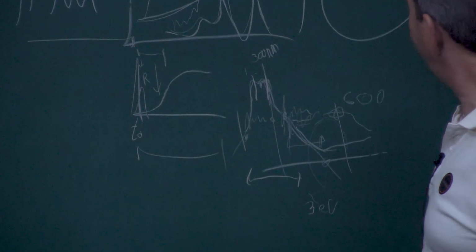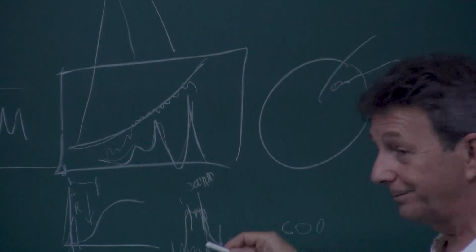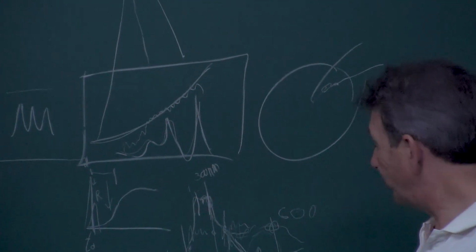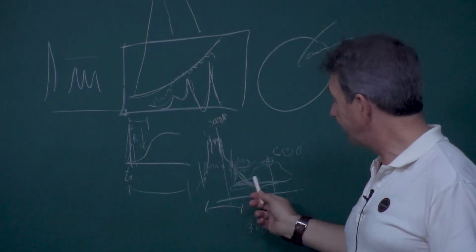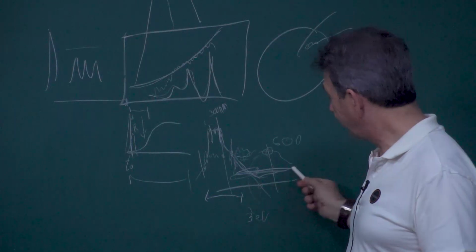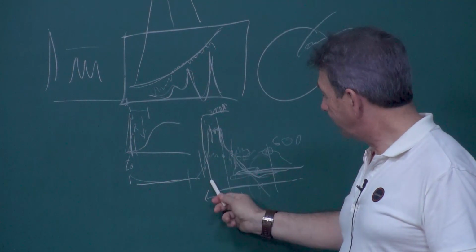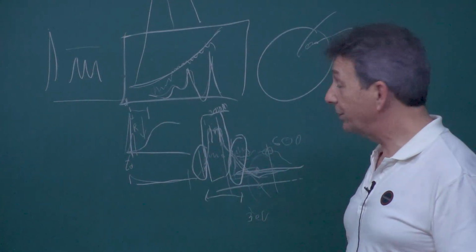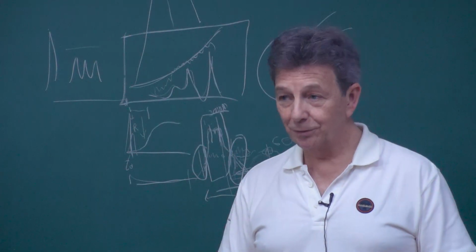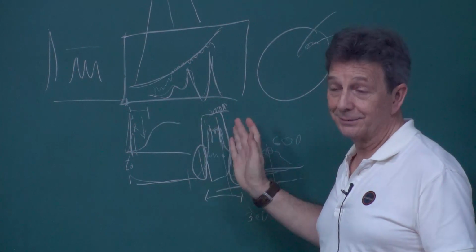Because you have your sample, you send in the photons, and then the scattered photons go out. If this sample is absorbing a lot, this may attenuate the signal, but usually this is very unlikely. Typically you are far from resonance, like here or there, or you are in the resonance region, and then you have this near resonance, which can be a little bit more confusing. But typically you are far from resonance or in the middle of resonance.